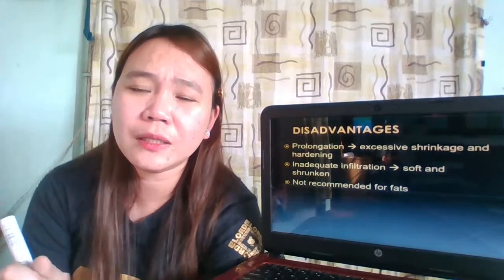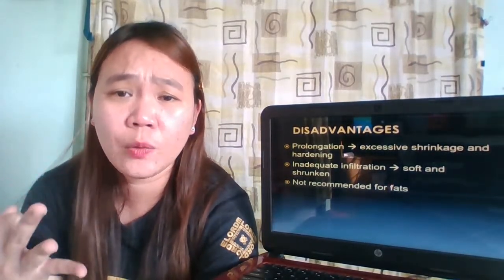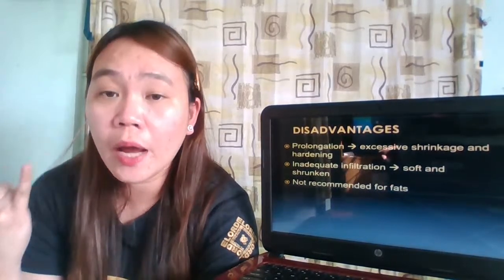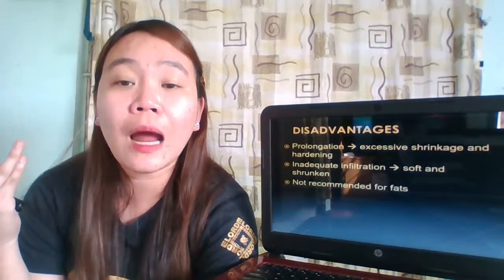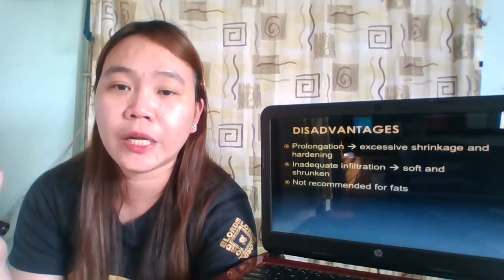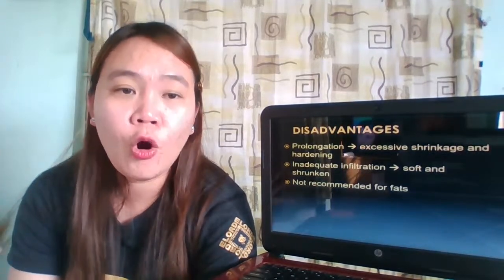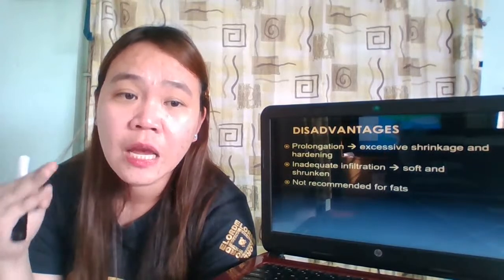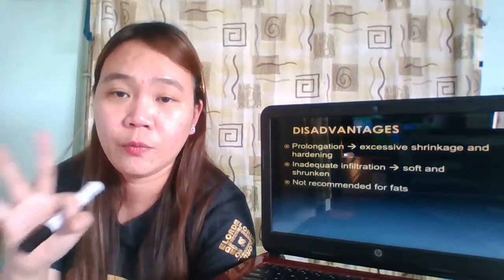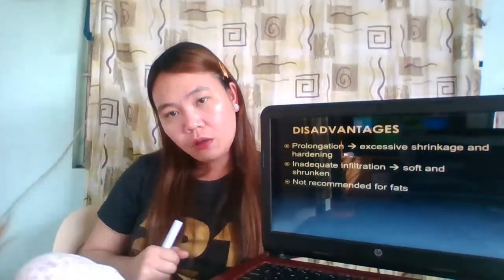So I repeat, what are the three manifestations of inadequate infiltration? Number one, soft and shrunken tissues. Number two, crumbling of tissue blocks during sectioning. And lastly, breaking up of tissue sections during flotation. We have three.